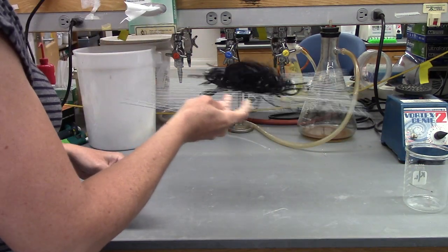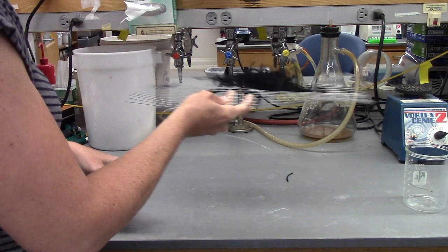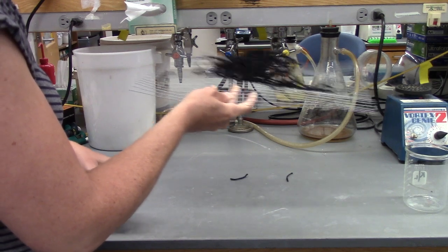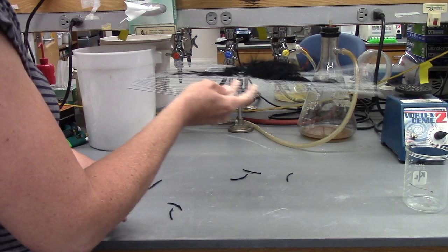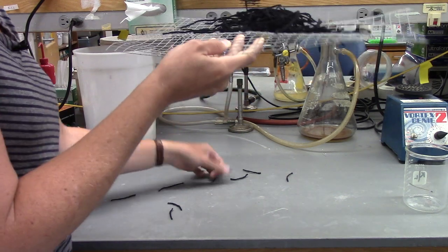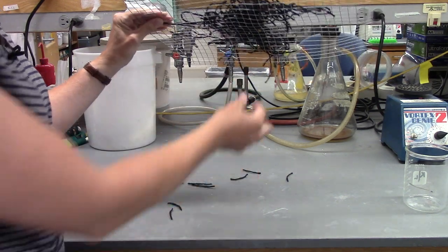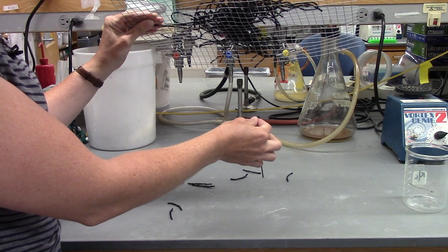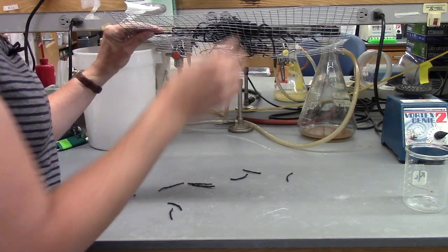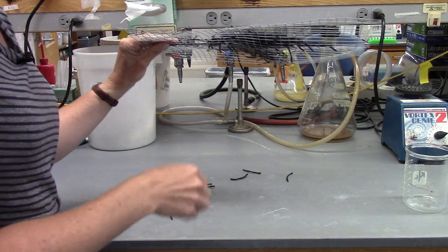And then I'm going to let gravity work. And you'll notice that the pieces of DNA, the yarn that falls through the mesh, are all short pieces. Some of the long pieces start working their way through. But it's going to take some time before they can make it all the way through. Whereas the little ones can sneak through the holes really easily.